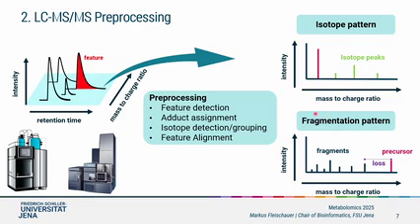and we need a feature-rich fragment spectrum. The interesting thing here is that SIRIUS really loves it if you have many fragment peaks. So in case you can measure multiple collision energies, it's always good to give them all, or merge ramped spectra, or whatever, merged spectra, everything fine. It doesn't matter whether they are separated or not. The important thing is that we have the fragments. Another important thing is obviously the precursor mass that needs to be known, but this is given in LC-MS. And also important are the neutral losses, but I can come back to that later.